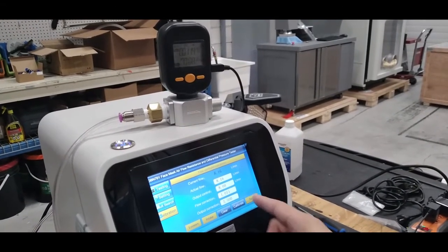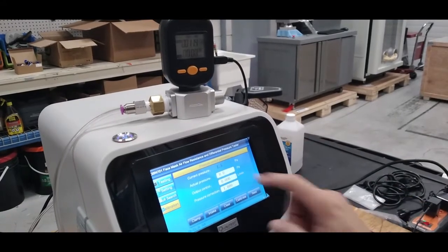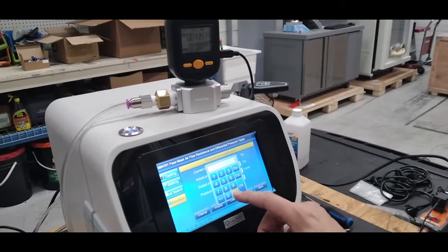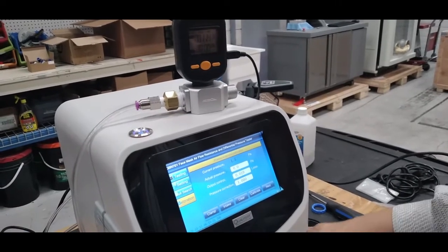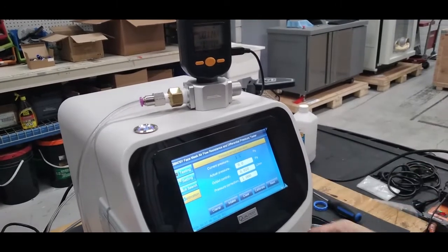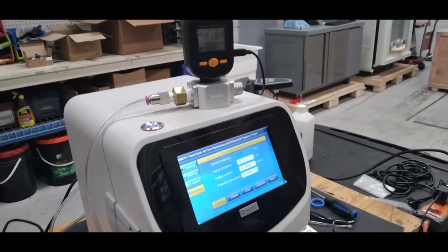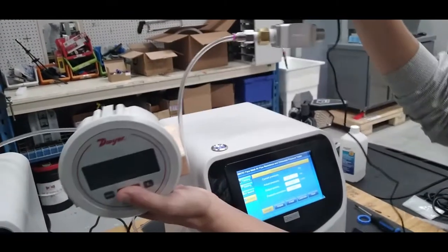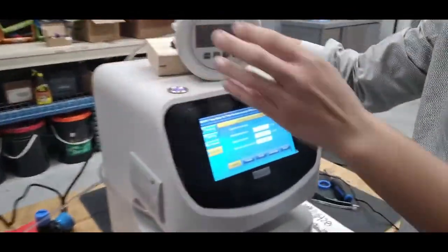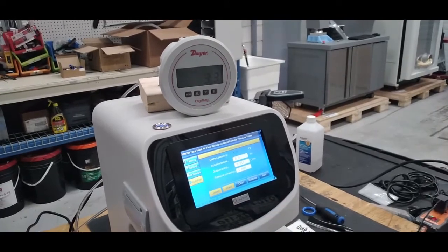Once the flow calibration is done, we're going to do the pressure calibration. Enter 0.01 for the flow control and place your blanking cap and clamp. Use the pressure gauge — not the flow gauge — press intake and connect your gauge.